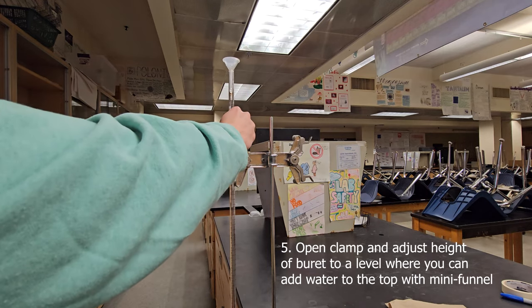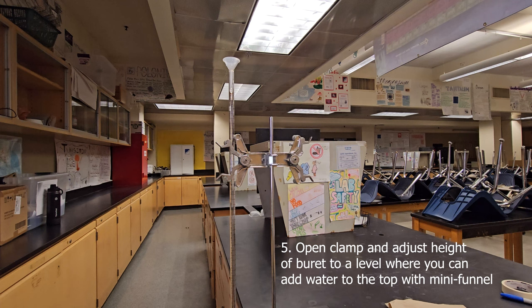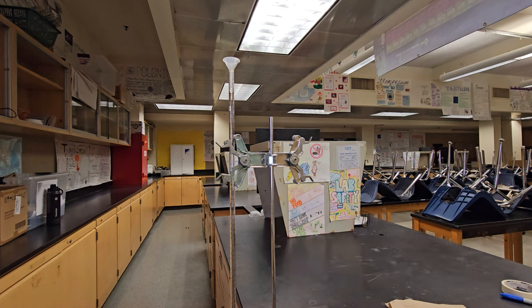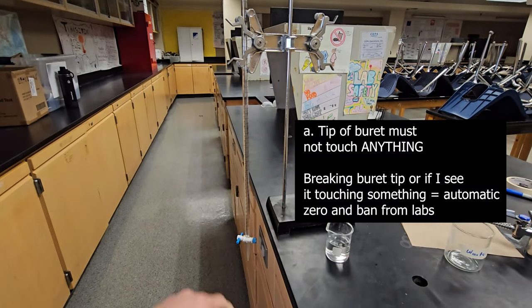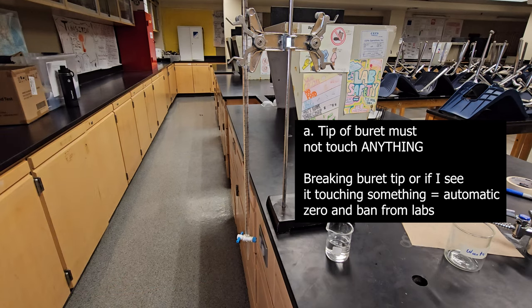Before we move on, make sure the tip of the burette does not break or touch anything. The tip is the very bottom part of the burette — it's very fragile and can break, and it can also be contaminated depending on what it touches. If I see the tip touching anything — other glassware, your hands — or if you break it, that is an automatic zero and you'll be banned from the lab.